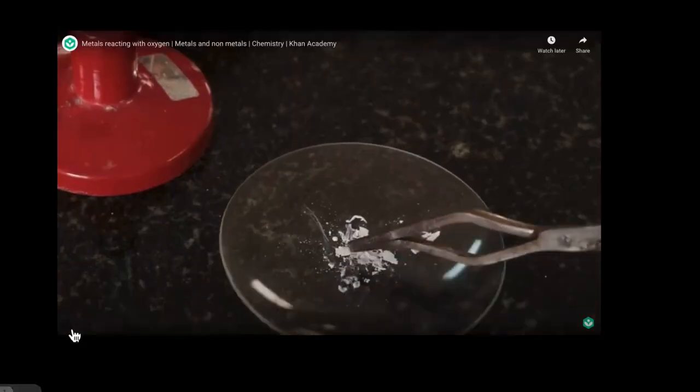Let's explore how metals react with oxygen. To do that, let's do a couple of experiments. We'll first take a small ribbon of magnesium and burn it and see what happens. Oh, it burns very nicely. And we get this white powder.